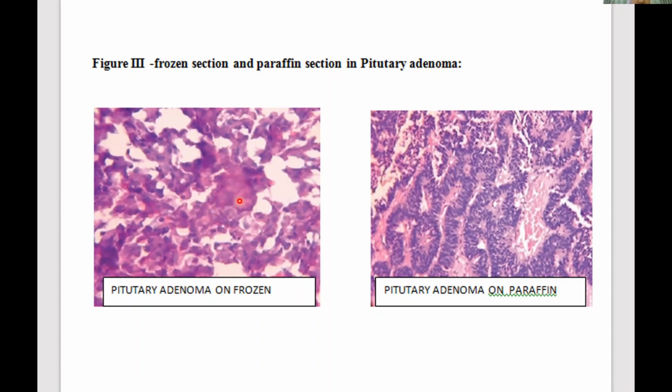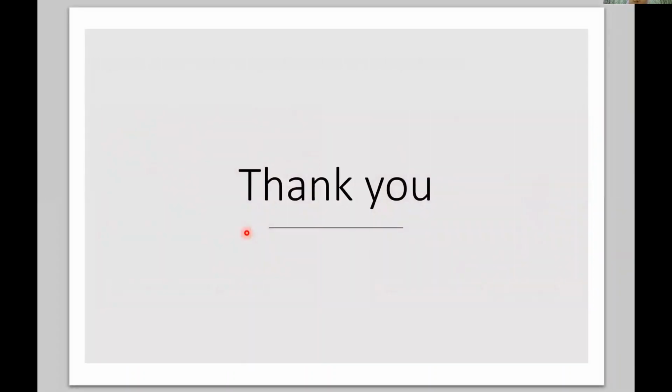That's why in frozen sections, we cannot give you the final diagnosis for a case of brain tumor. We can only say whether it is high grade or low grade, because it's quite difficult. There is the artifact, these spaces here, frozen artifact. I think that's all.